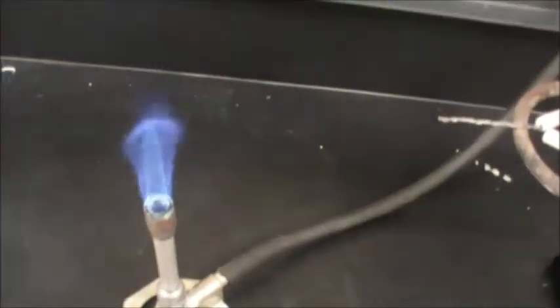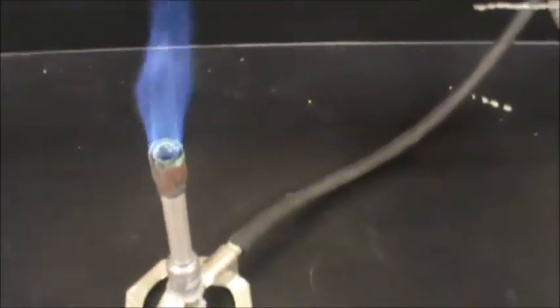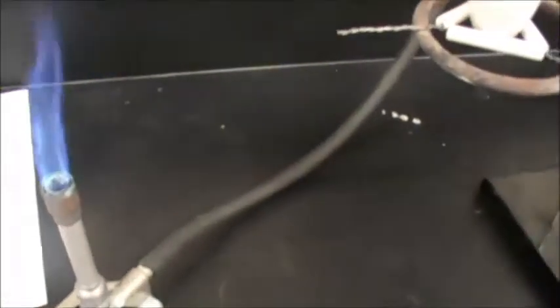I'm going to try to do this one-handed, see if this works. Oh, and then I got my mass. I got my fire. So I got my Bunsen burner burning, and what we want to start doing, like it says in the procedure, is to heat the crucible gently. Alright, so the crucible should be in the flame and we're going to heat it gently.